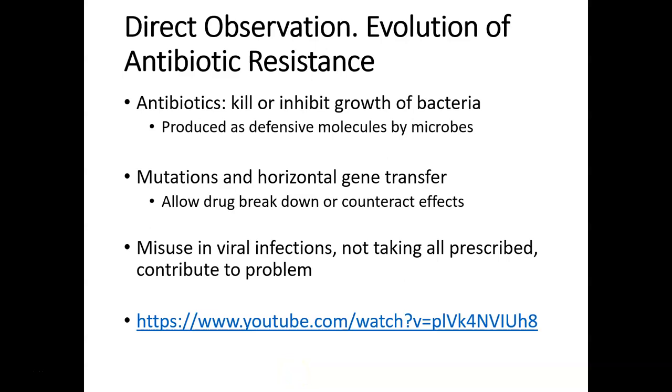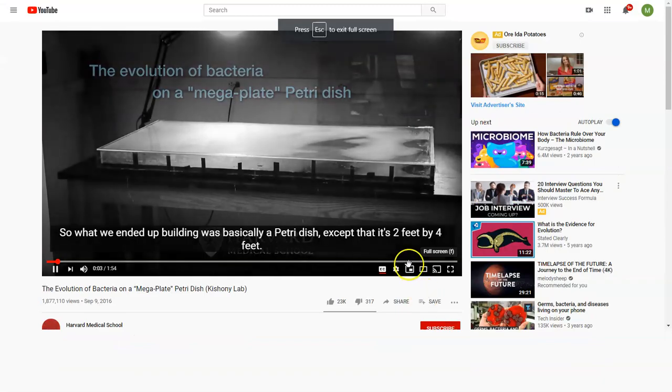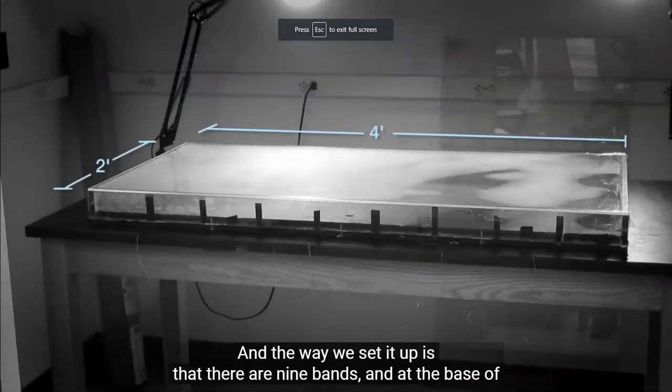Now I'm going to show you a video that demonstrates just how quickly bacteria can evolve resistance to antibiotics. So what we ended up building was basically a petri dish, except that it's 2 feet by 4 feet.